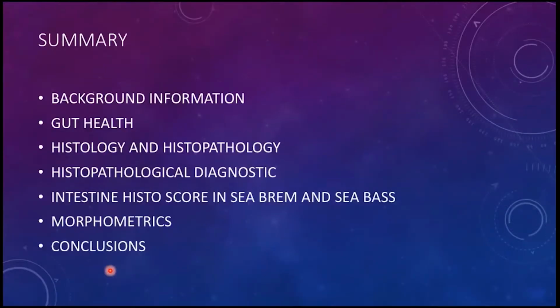In this talk, I will give first of all some very basic background information about ourselves, and then obviously I will introduce gut health and also histology and histopathology as techniques for the study of the intestine.